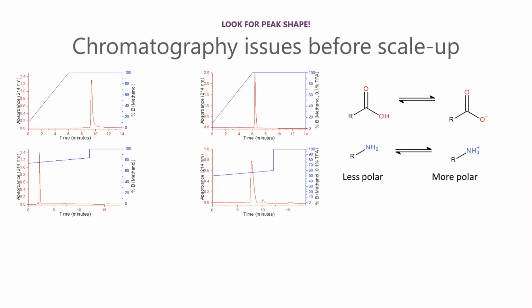If it looks bad during the scout run, it will look worse in the focus gradient no matter what calculation method is used.